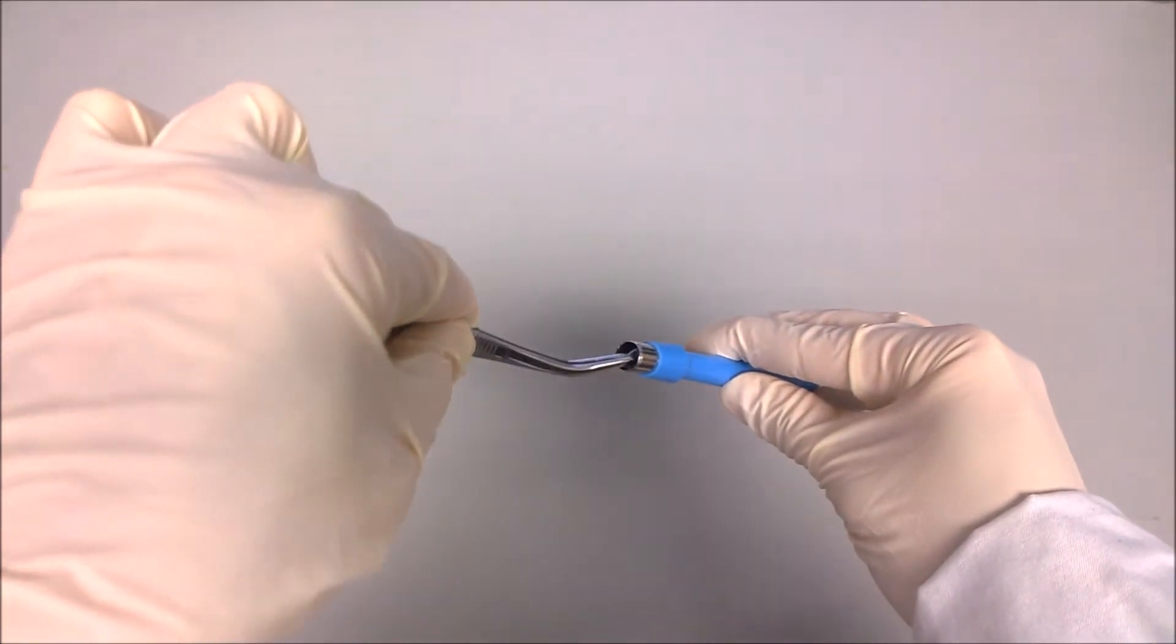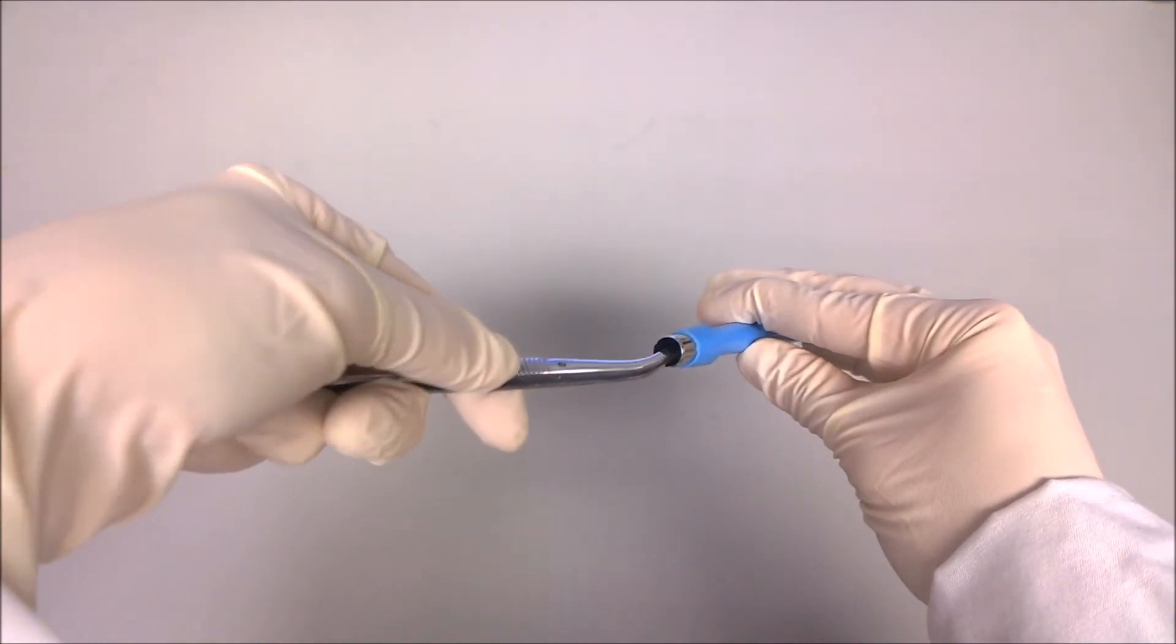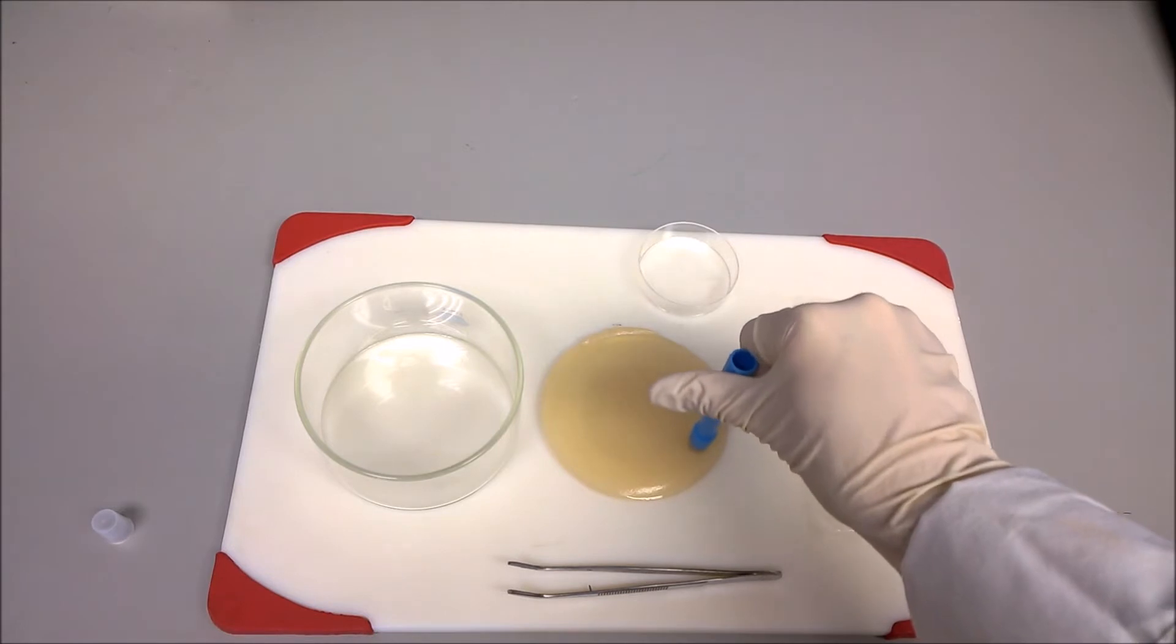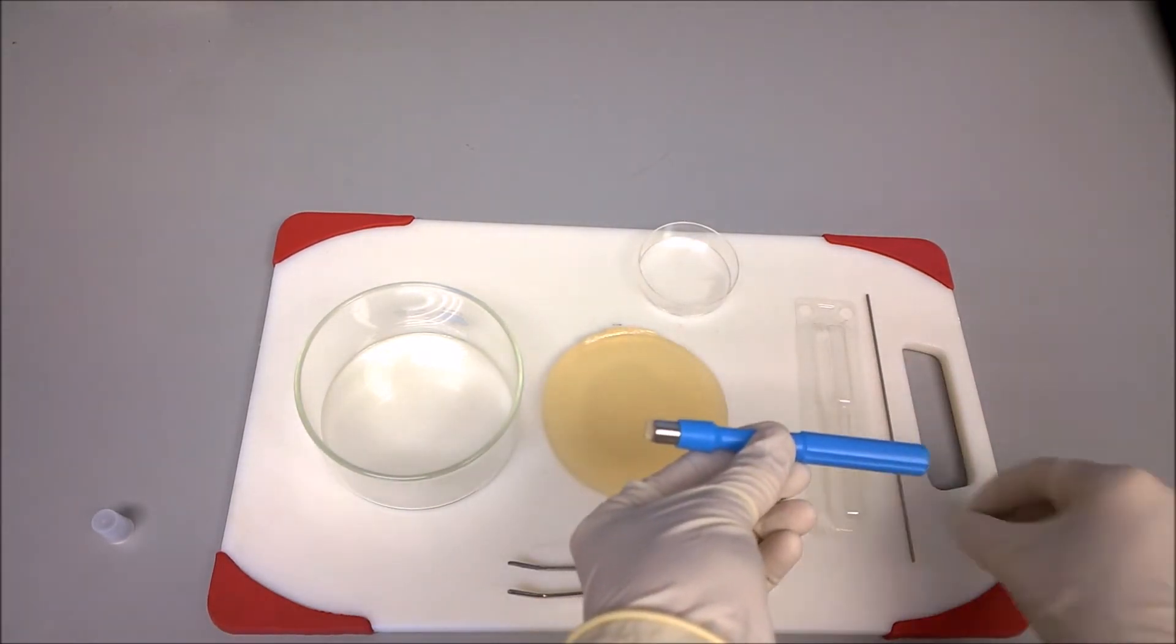Ensure that the plastic disc is inside the biopsy punch and then punch the hydrogel. Carefully use the metal rod to help release the disc.